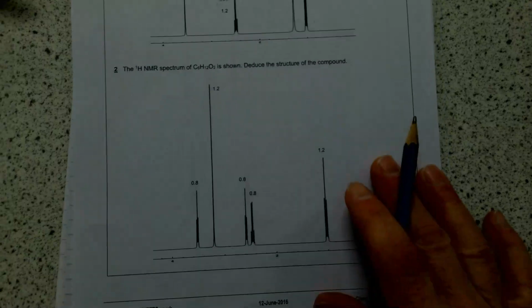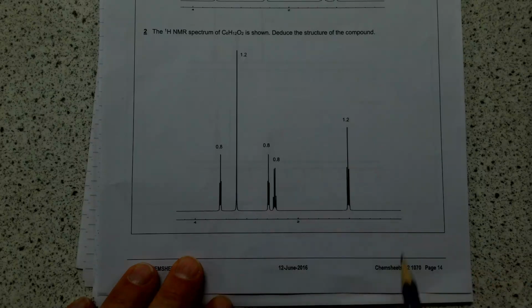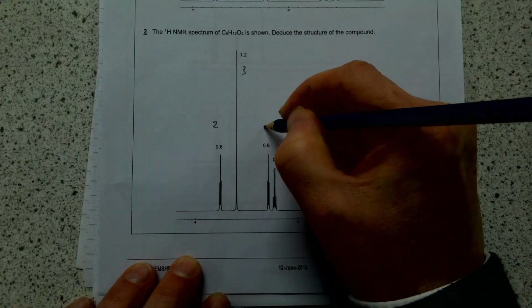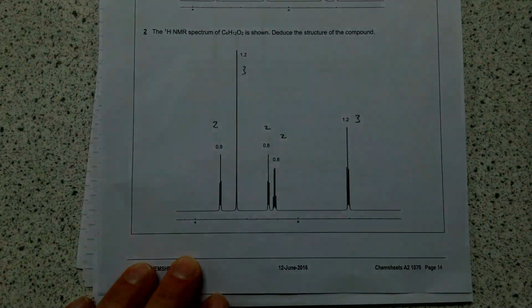And so this one here underneath, if we divide all of those numbers by 0.4, you'll realise you've got a 2 to 3 to 2 to 2 to 3 ratio of hydrogen environment.